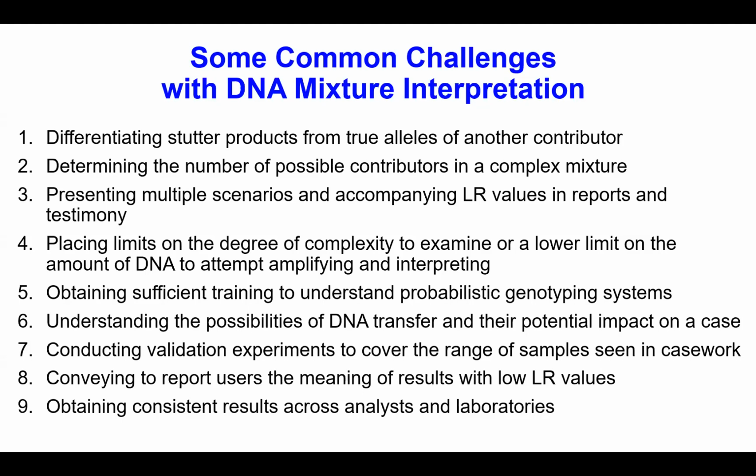There's also many new probabilistic genotyping systems that have become available, so do we have sufficient training in the community for that? That's something we've considered as we've been looking at this. Understanding the possibilities of DNA transfer and the potential impact they could have on a case. We spent a lot of time thinking about this topic and the relevance issue that can relate there.